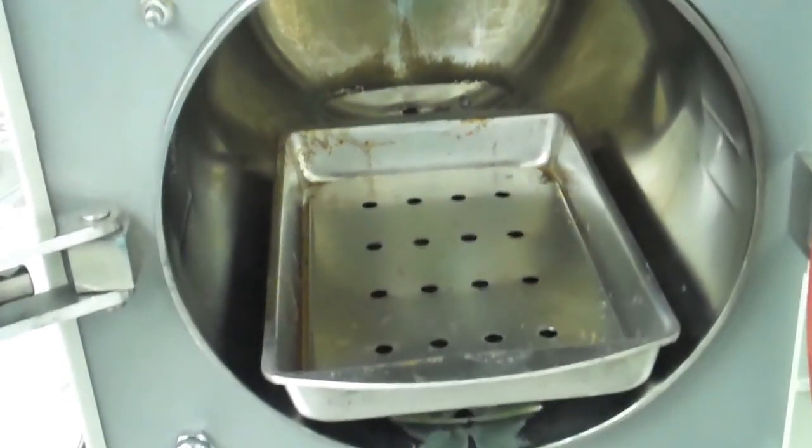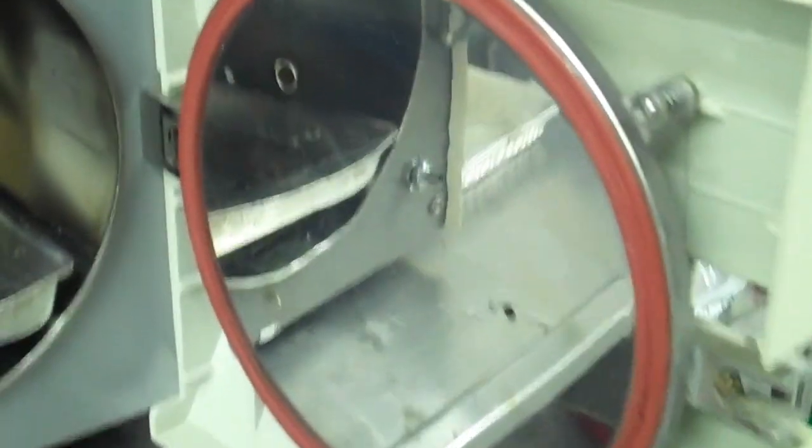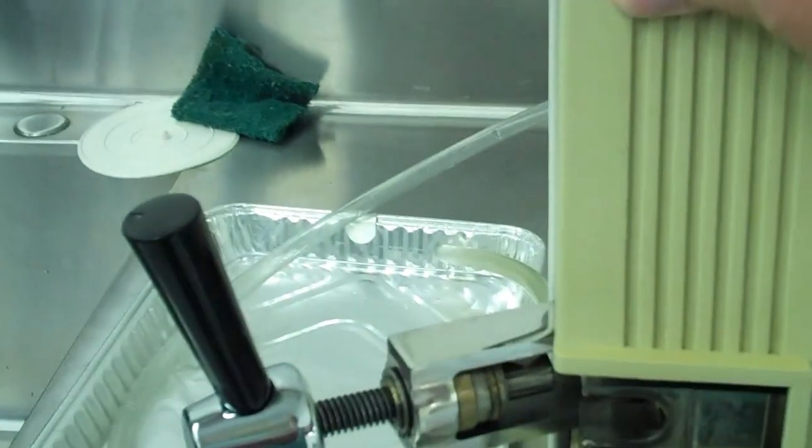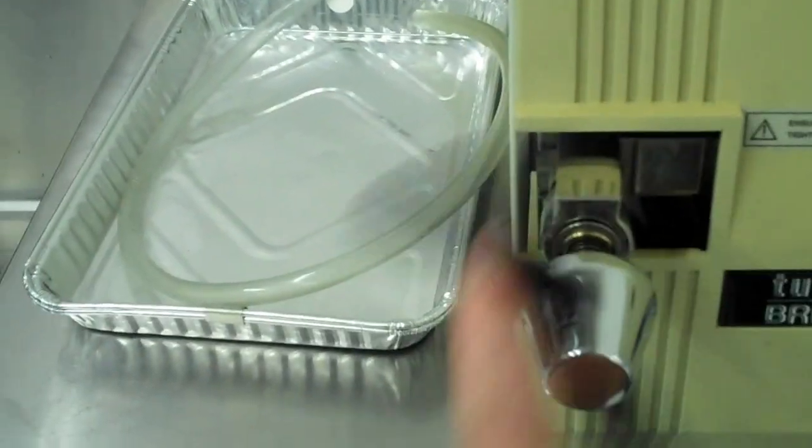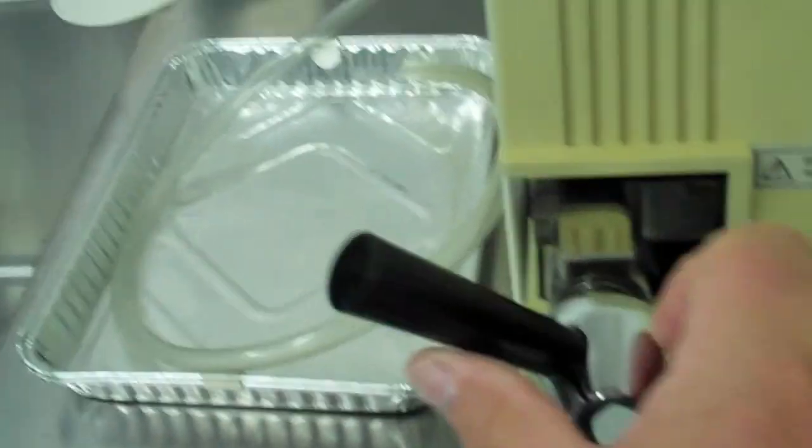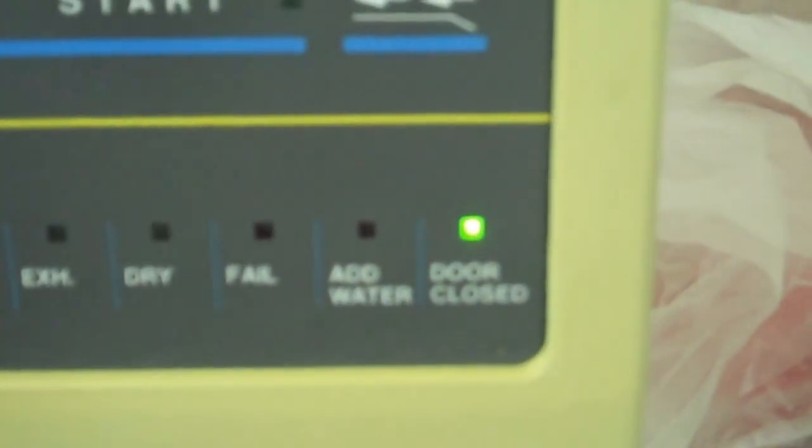Since this is a pressure cooker, you can see there's a door with a gasket just like a pressure cooker. When you close the door, you probably heard that click. It doesn't show door closed yet, so then we spin down the handle and you heard that click. That click says door closed.